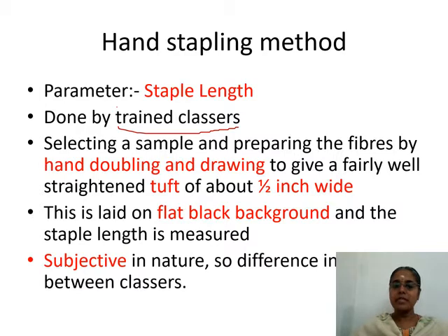In earlier days, they would take such people to the market and they would check the fibers there and purchase the fibers. Now it is not a common practice. We rely on instruments now. But it is good that you get trained in the fiber so that you are not blindly accepting any result.